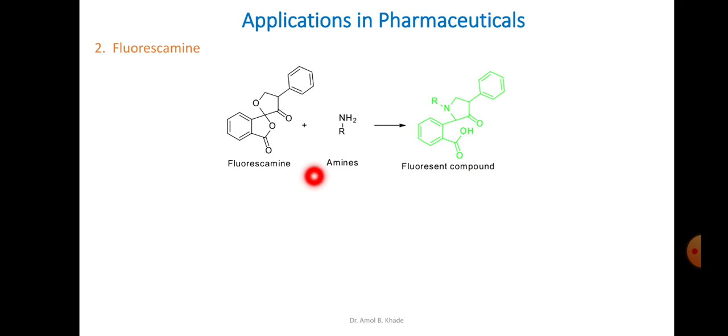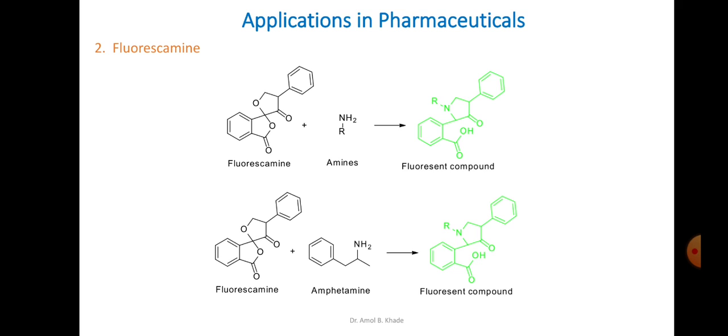Okay, so you can see there is a ring opening here, so this bond between the carbon and oxygen is getting broken, and then this will be a carboxylic acid here, COOH, and this oxygen is substituted by the nitrogen of the amine, and this is what is getting formed here. So initially both were non-fluorescent, but after combining them, by the chemical derivatization, the formed product is highly fluorescent, and then you can easily quantify it with fluorescence spectroscopy.